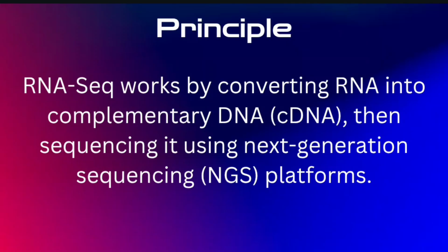RNA sequencing works by converting RNA into complementary DNA or cDNA, then sequencing it using NGS or next generation sequencing platforms. The generated sequence data is aligned to a reference genome or assembled de novo to analyze expression levels.